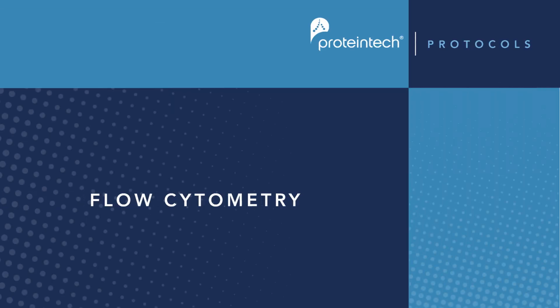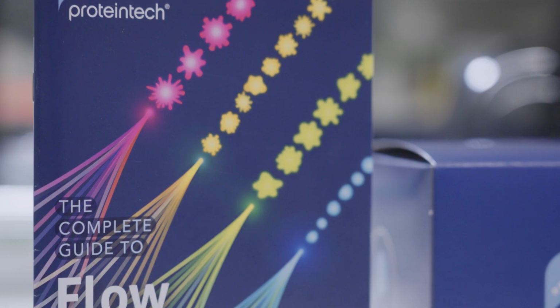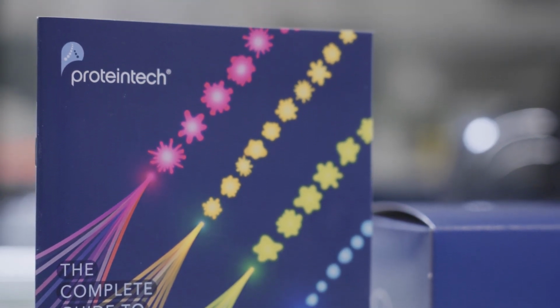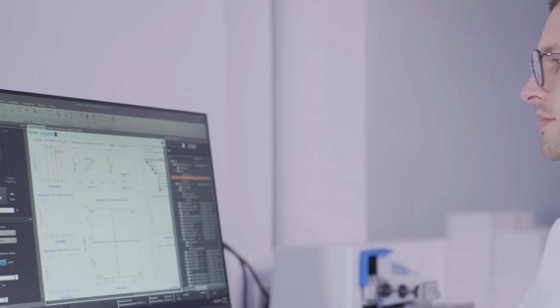Flow cytometry is an immunoassay technique used to phenotype single cells in suspension. This video will teach you how to stain your cells with fluorescently labeled antibodies and viability dye for flow cytometry analysis.